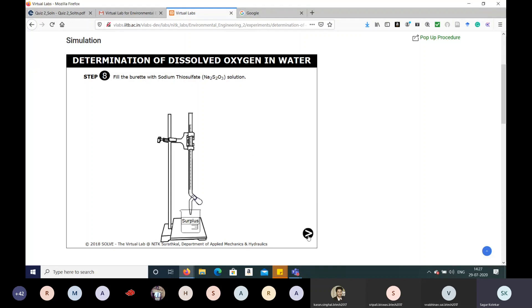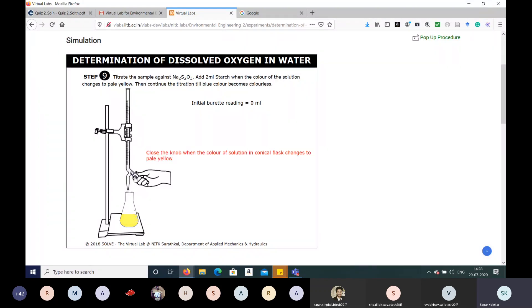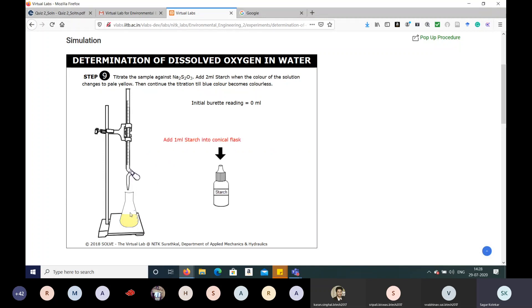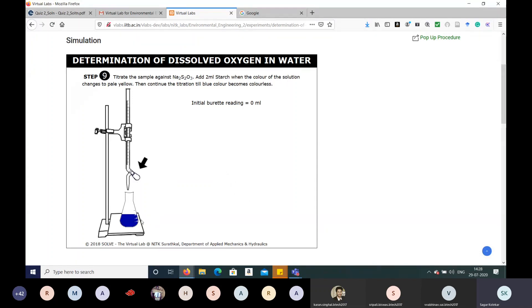Now perform the titration: open the burette knob and close it when the color of the solution in the conical flask changes to pale yellow. Add 1 mL of starch to the conical flask. The total quantity of sample in the conical flask is 200 mL of sample plus 1 mL of starch, giving 201 mL total.